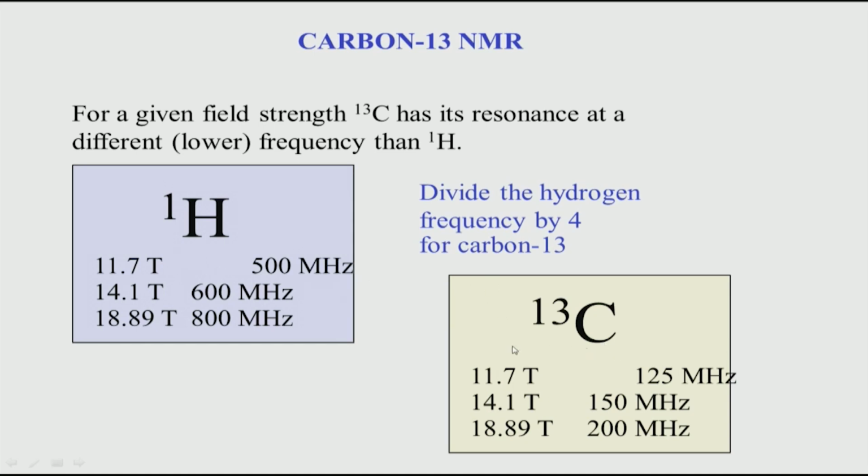This is very important because when you convert the ppm scale to frequency, we have to keep this in mind. For example, let us say there are 2 peaks in proton which are separated by 1 ppm. That will be 500 hertz for proton, because in that equation we saw in the last part, you just multiply the frequency 500 by the ppm difference, and that is the difference in hertz. But if you come to carbon, the difference in hertz will be different, because the same 1 ppm difference in carbon peaks will now correspond to 1 into 125, which is 125 hertz. So, you see the difference is reduced compared to proton. That means proton is more resolved, more well separated in terms of hertz value compared to carbon.